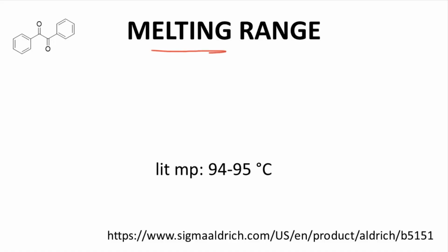That's fine. The product is not 100% pure, but the TLC is pretty nice. How about the melting range? The literature melting range is 94 to 95 degrees Celsius based on Sigma Aldrich. The experimental melting range is 92.5 to 94.2 degrees Celsius. That's fine. So far, both the TLC and melting point look pretty good. Let's see what the NMR says.